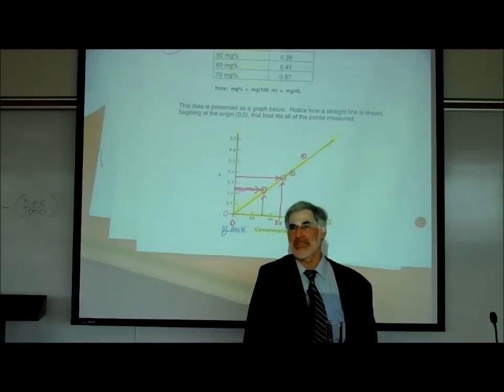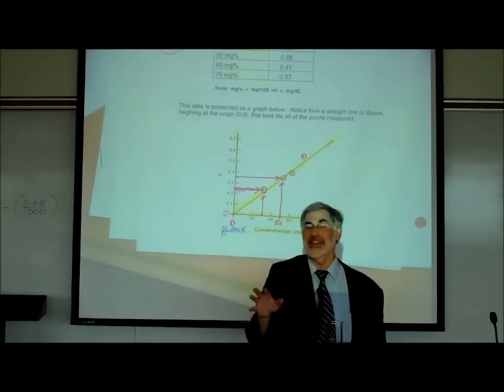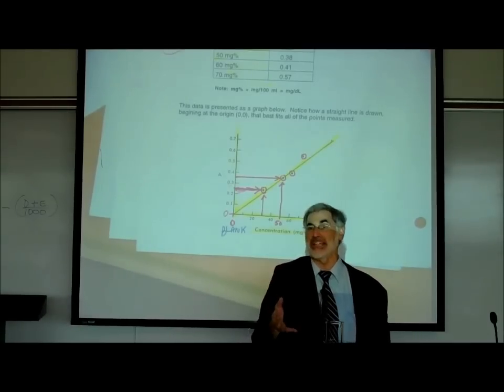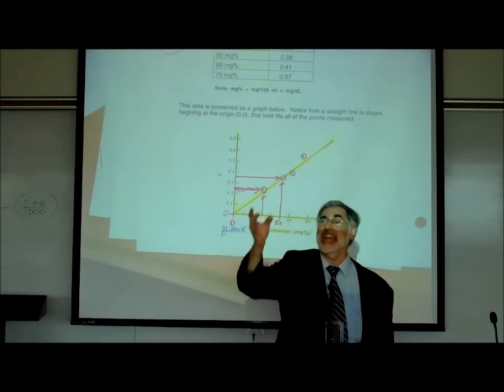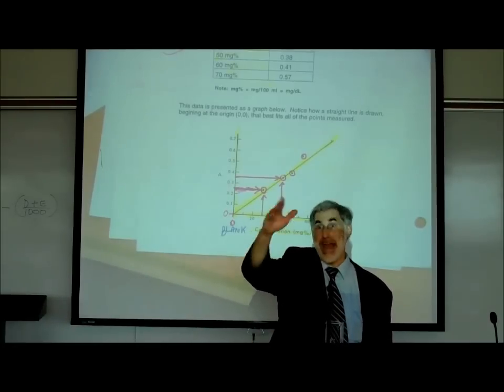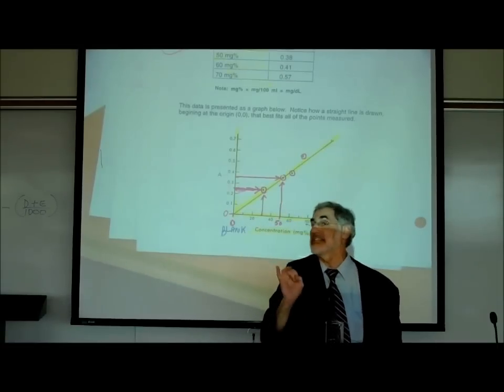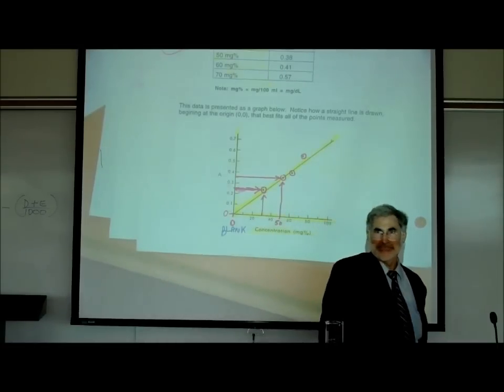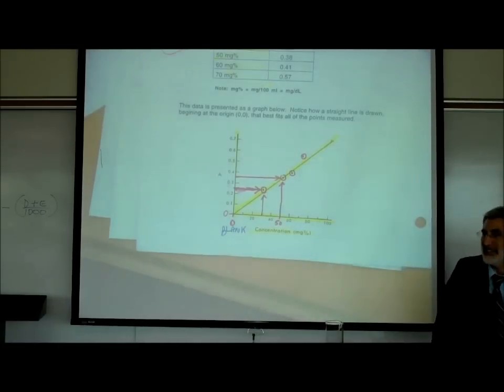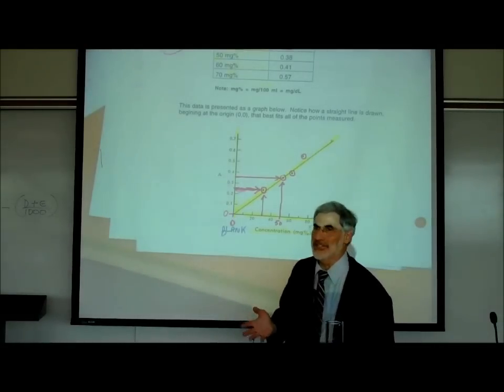Is it still water we use, or just regular water? Well, it doesn't have to be water. It could even be blood plasma, it could be anything. The definition of a blank is, make sure you know this, because I'm going to ask it, zero amount of whatever we're trying to determine. So it's irrelevant whether it's deionized water or regular tap water.